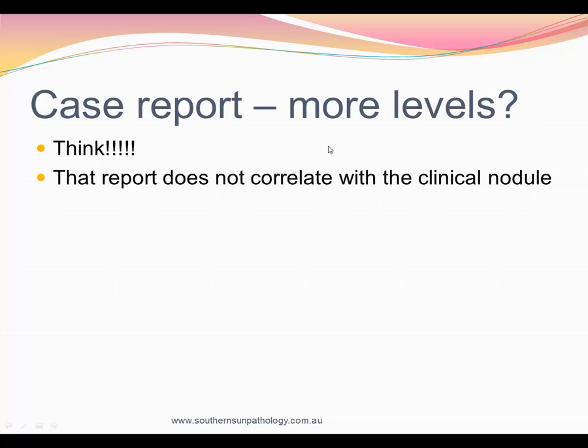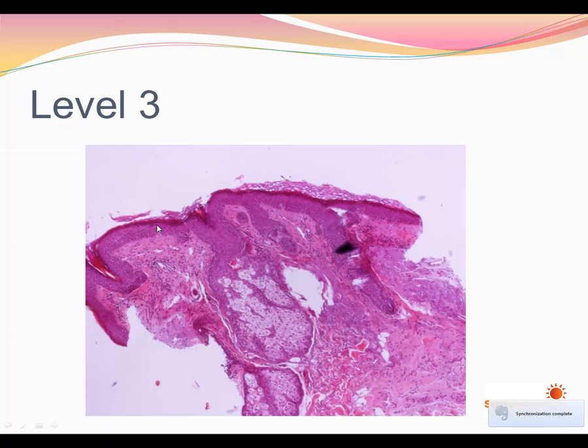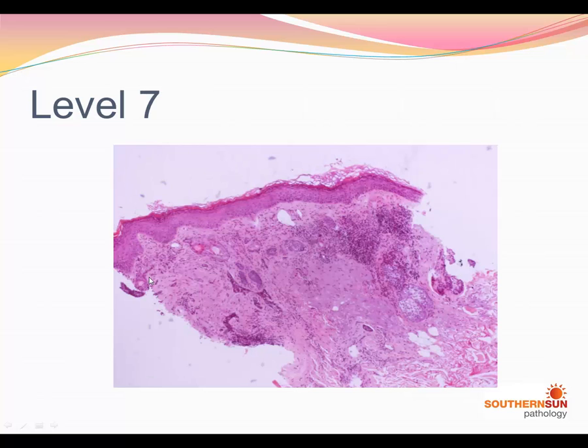This is what level one looked like — the epidermis, sun-damaged dermis, a bit of sun damage and solar keratosis on the surface, and a bit of inflammatory infiltrate. Level three looked very similar, and this is essentially what the pathologist reported on. But because there was discrepancy between the clinical and pathological diagnosis, I asked for deeper levels. Level five showed a similar thing, but in level six we began to see little strands of basaloid epithelium infiltrating within the dermis, highly suspicious of morphoeic basal cell carcinoma. In a slightly deeper level, you can see lots more strands of infiltrating BCC throughout the dermis.